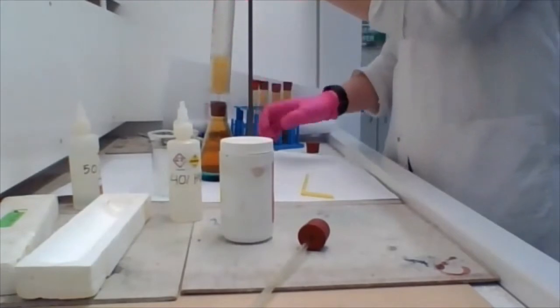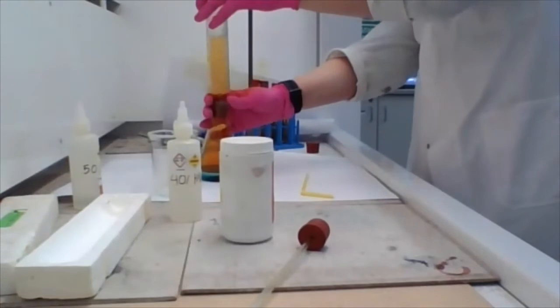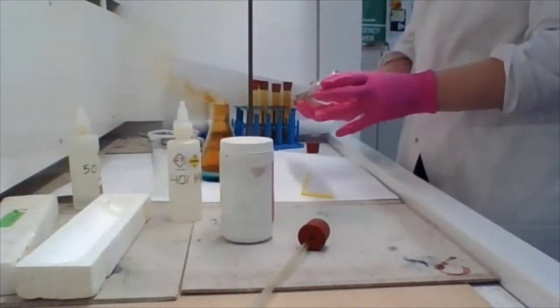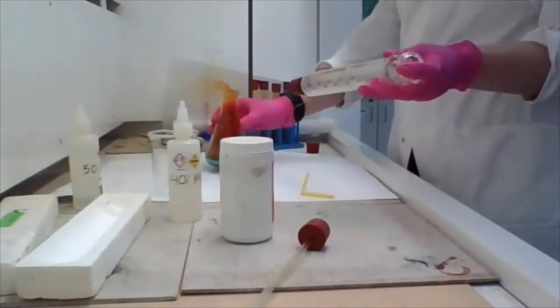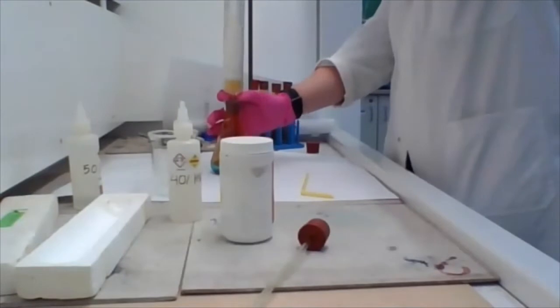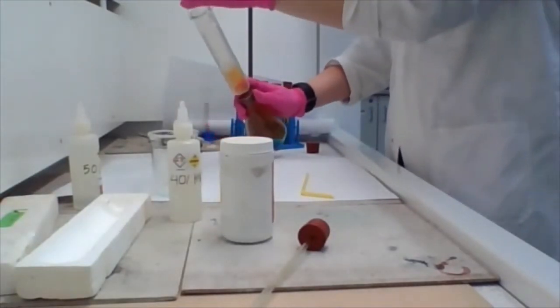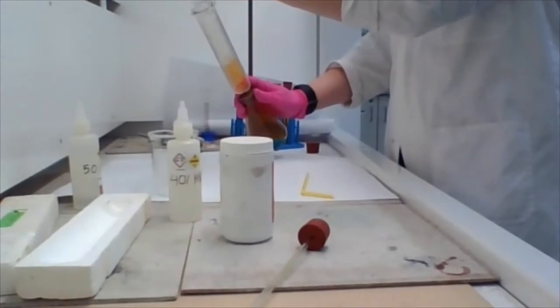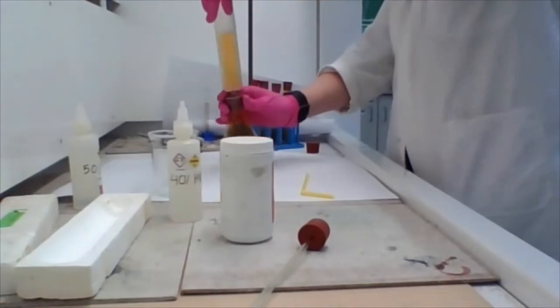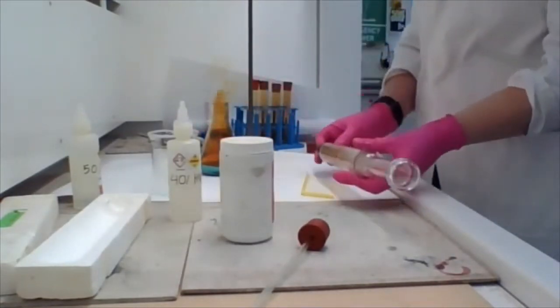I tried to get my phone camera to record it, but I was worried about breaking the gas syringe, so I didn't. I am in a fume cupboard. That is why I am not worried about letting that gas escape. So I'm not quite sure what happened there, why I tipped out that syringe and started again. But you can see that that is quite a distinct dark brownish colour.